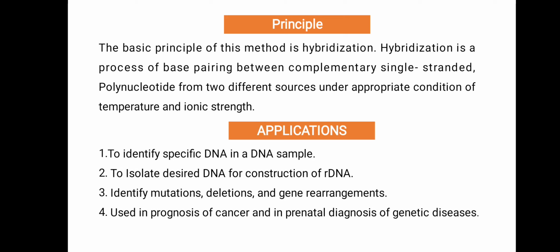Applications: to identify specific DNA in a DNA sample, to isolate desired DNA for construction of rDNA, to identify mutations, deletions and gene rearrangements, used in the prognosis of cancer and prenatal diagnosis of genetic diseases.